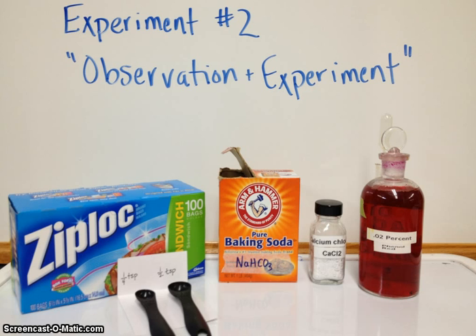Because phenol red is a solution of the dye dissolved in water, it is actually composed of two substances. Thus, water must be considered as the fourth substance, variable, in the overall reaction, and its effect should also be examined.